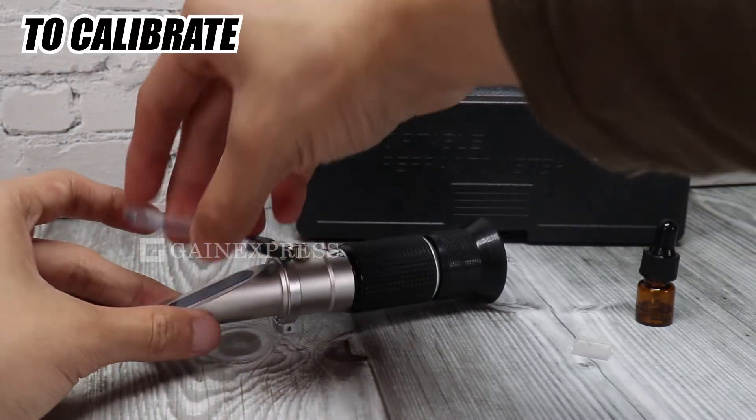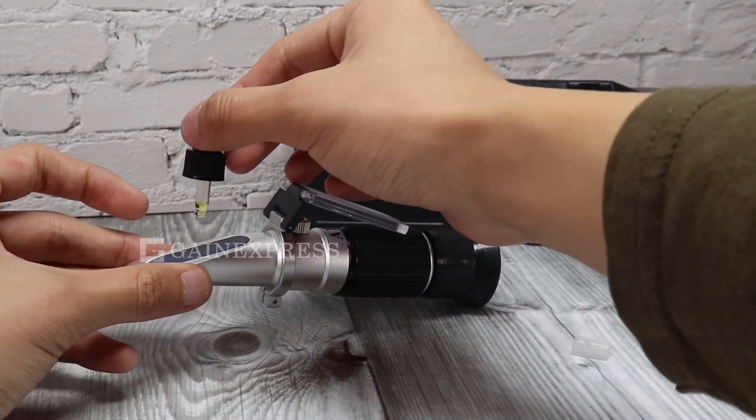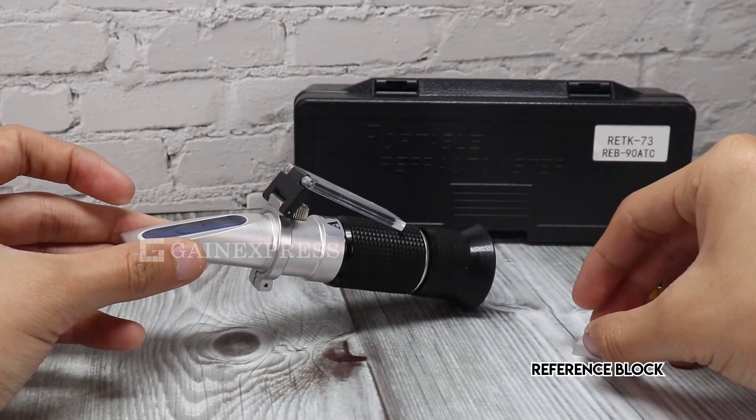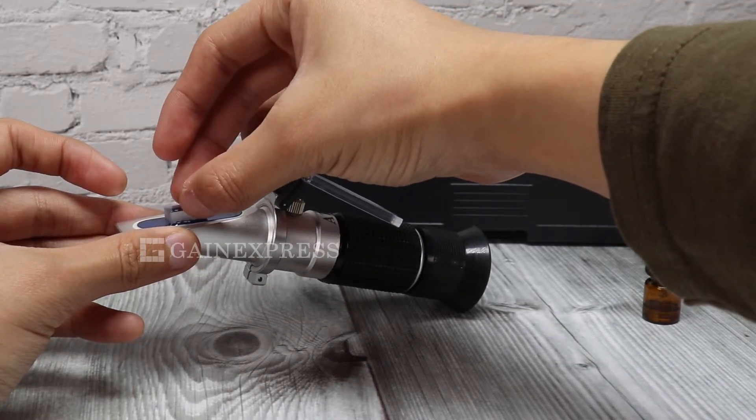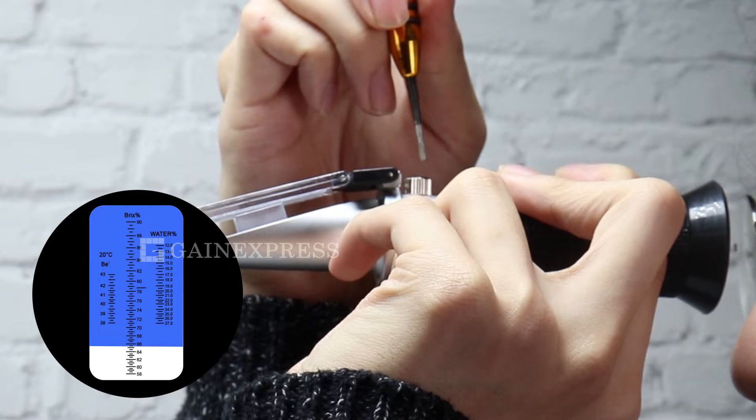To calibrate, open the daylight plate. Place a drop of dioptric oil on the surface of the prism. Stick the reference block on it. Close and press it lightly. Face the prism in the light and look into the eyepiece to check the reading.